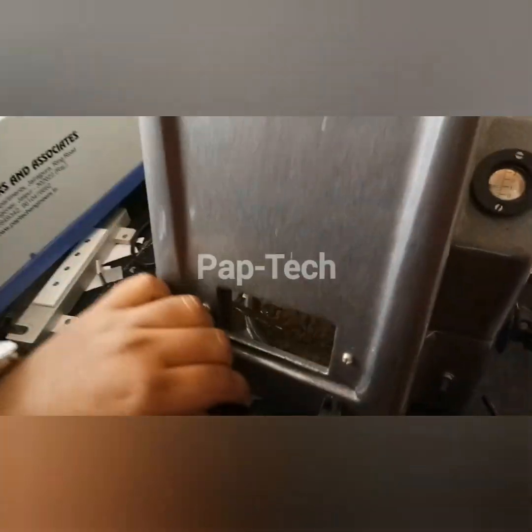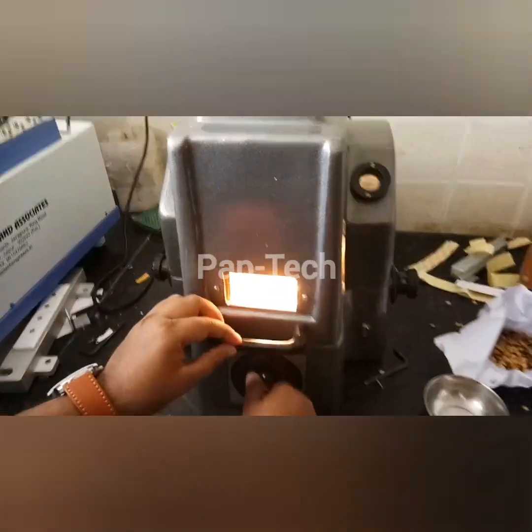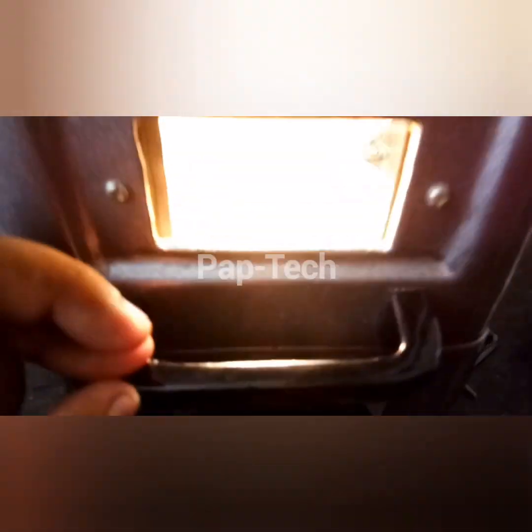Now we have to close this and start the thermometer. We have to set this temperature to 50 degrees Celsius. The temperature should be specified between 40 to 50 degrees for good and accurate readings.